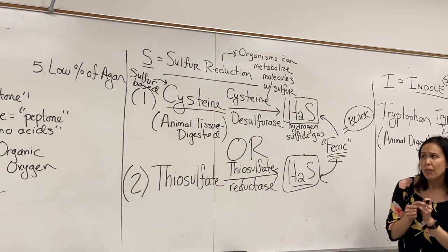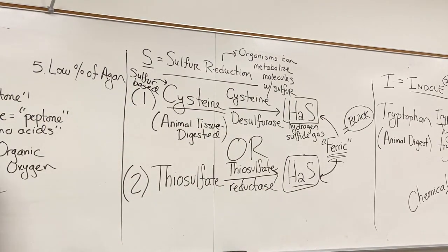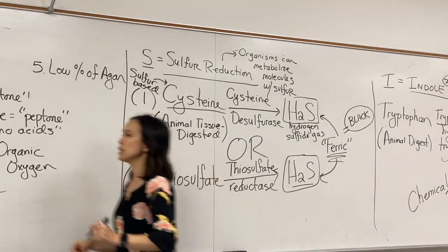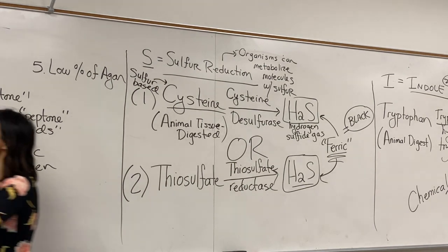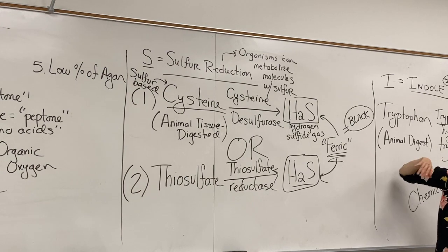One thing I did want to add though, because you're probably going to have to do it on the organisms from today, is that sometimes it might be hard to assess what's happening along the stab line. So you can definitely check out motility up here, on top, in the sense that if they're moving around, they'll spread out, even in that top film layer, if that makes sense.